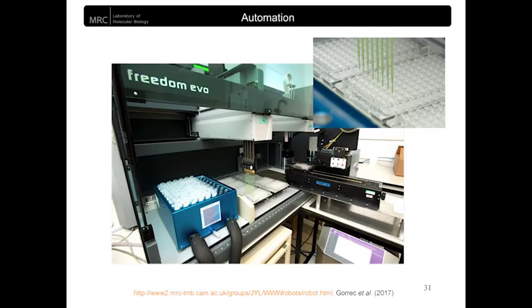Automation enabled high-throughput crystallization. An important aspect of our strategy at the LMB is to proceed with a relatively large number of initial conditions when the amount of sample allows it. Users of a facility are being given the opportunity to screen their samples against over 2,000 conditions. For this, various standard minimal screening kits are assembled into pre-filled MRC96 well plates by the fully automated system shown here.